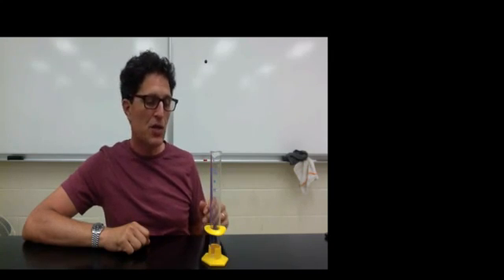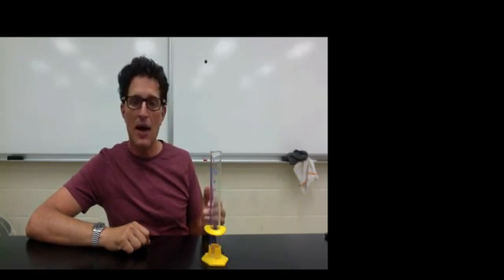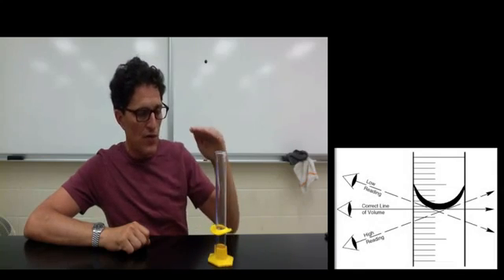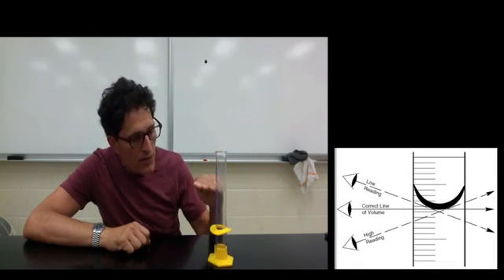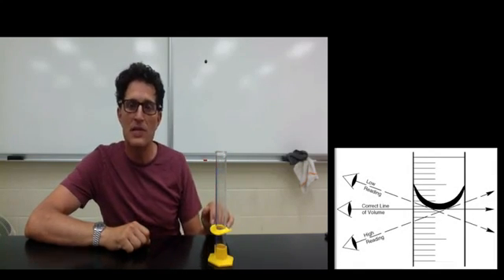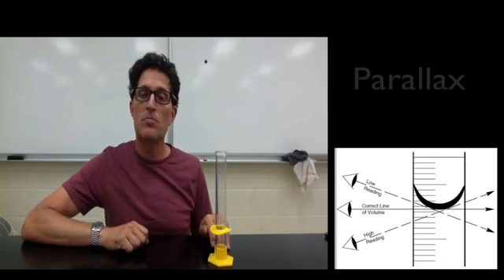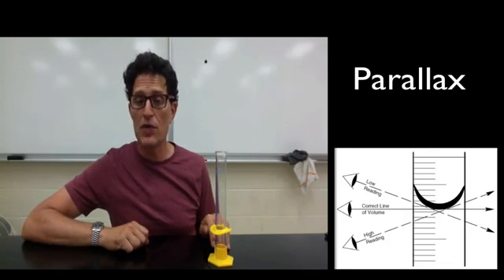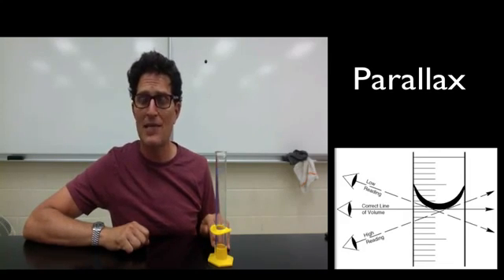Next, you want to make sure that you're reading the volume at eye level, which means that you need to move your head down to the volume in the graduated cylinder to avoid something called parallax. And I'm expecting that you'll research parallax and find out what exactly the problem is that it creates.